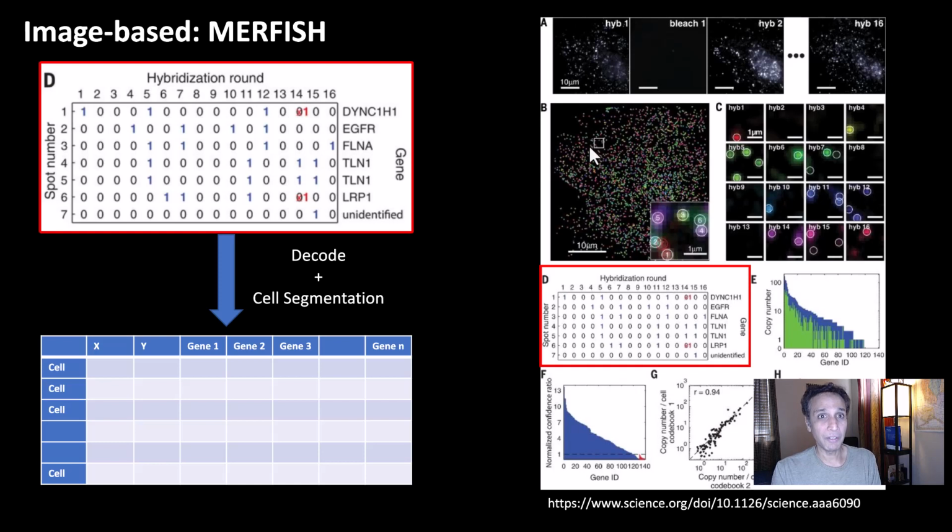The implementation can be very tricky, as you can see. At a high level, it makes sense. I hope it makes sense to you. Eventually, as I mentioned already a couple of times, what you get out of this entire experiment is cell number 1, cell number 2, cell number 3, where they are located, and what genes are actually found, and how much intensity from each of these genes. Because some of those genes you have very low intensity, you may as well ignore. Some are lighting up very high. Some are lighting up just because it's an error, because you need to do some error analysis here, because some may just light up, I don't know why, for some other reason, right? And you need to take care of those as part of your post-processing, but let's not get into that yet. This is the table that you end up with once you perform this analysis.